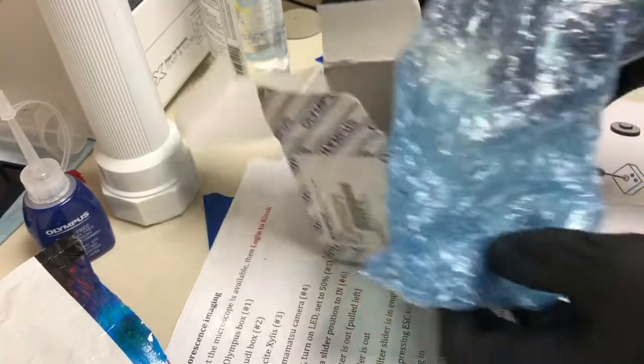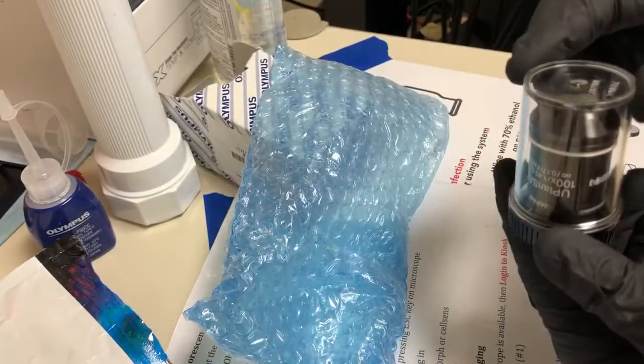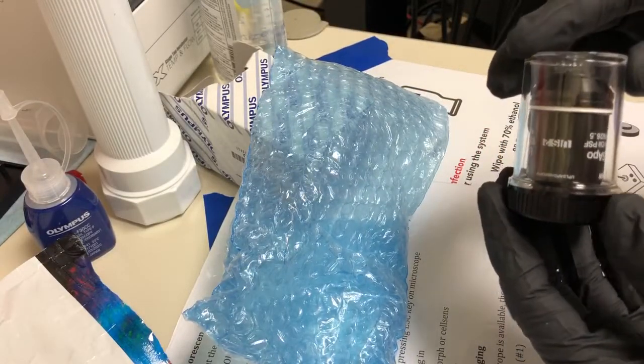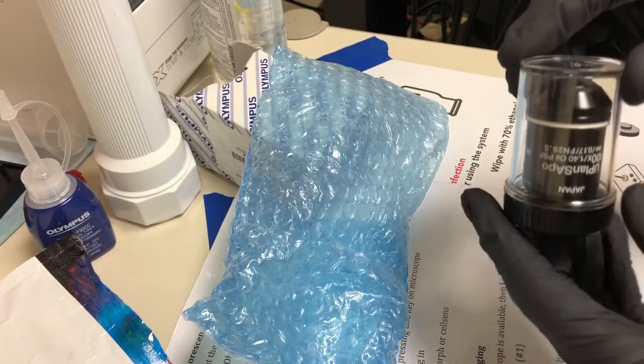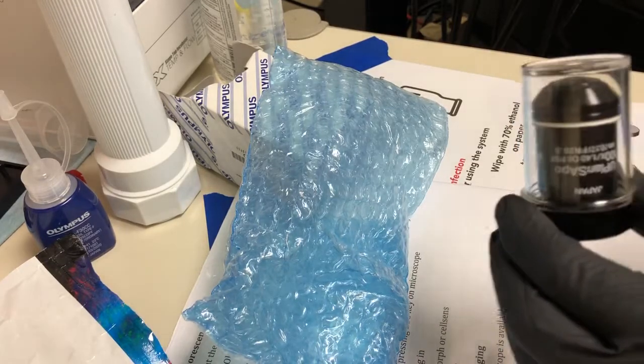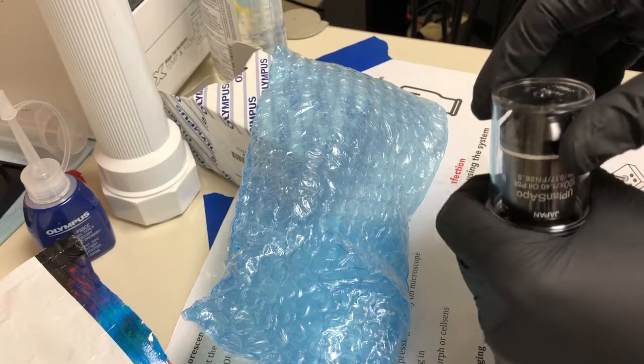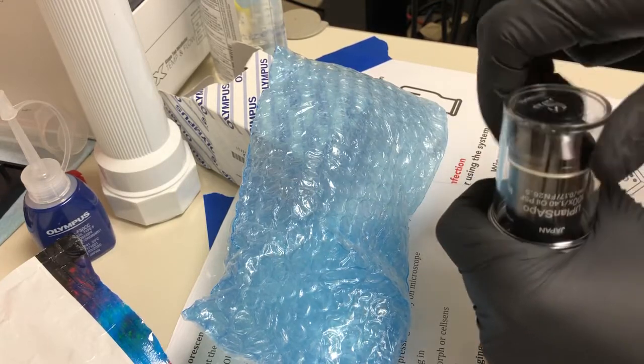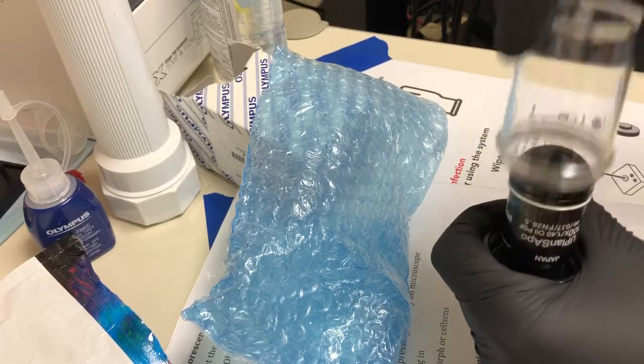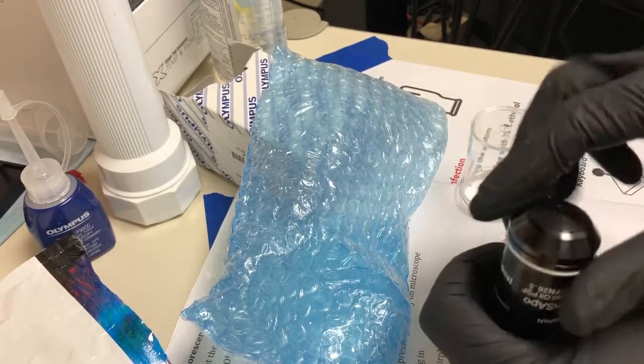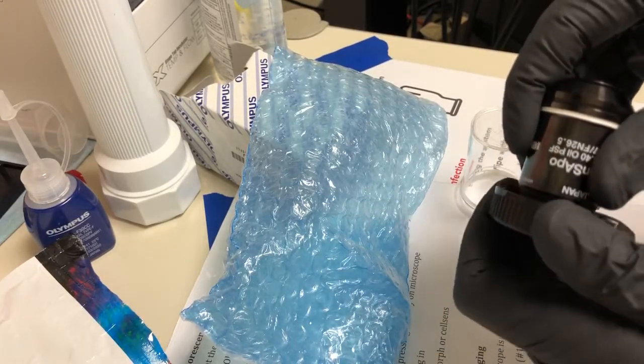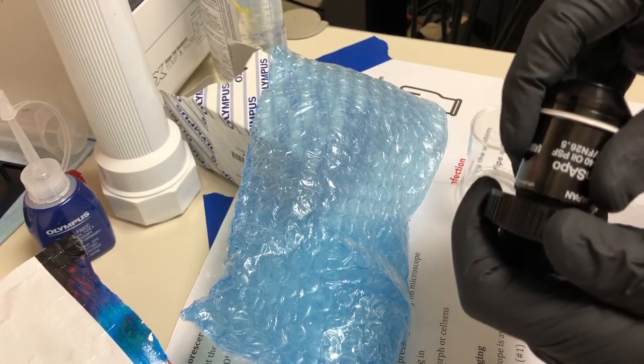Inside the bag, there's a holder for it. The objective is screwed onto the base, this black thing, so we can hold the black part and unscrew the top to access the objective. Then we can hold the objective and unscrew the bottom when we're ready to put it on the microscope.